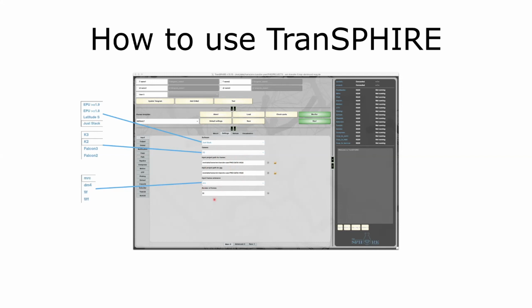And you can also provide the number of frames, so it will run a sanity check on every input file if the expected number of frames is actually met. So corrupted images do not make it inside the pipeline.